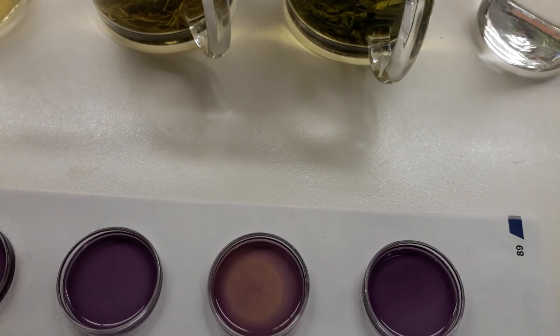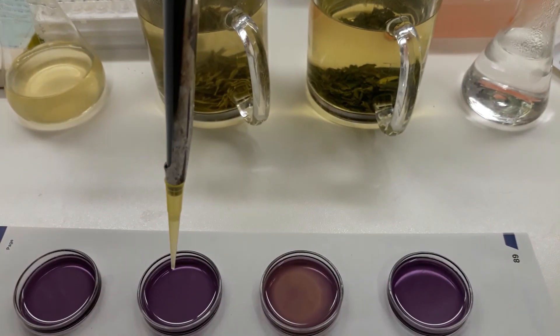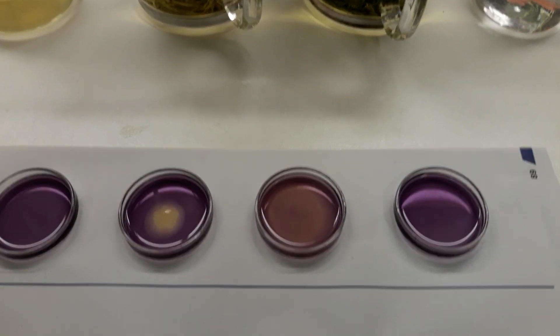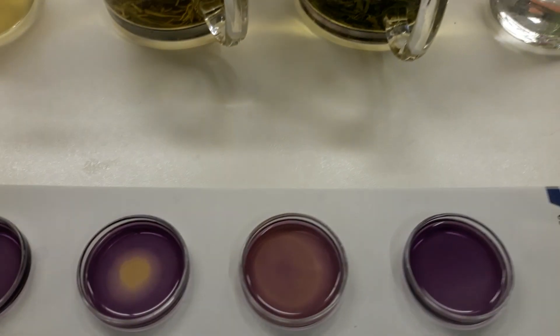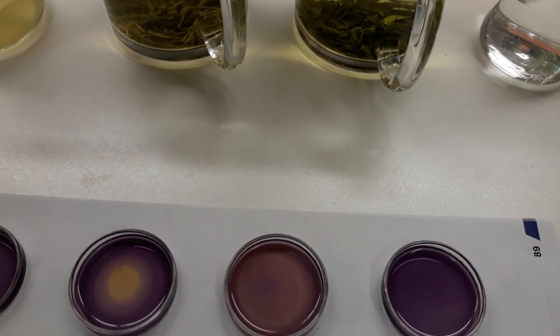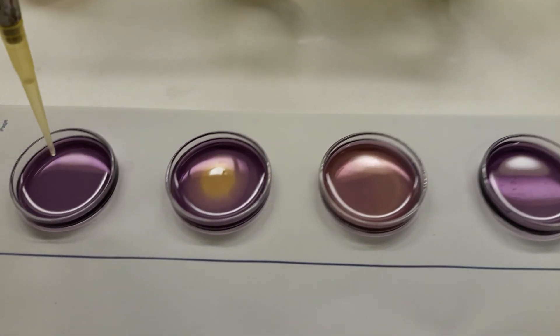Now I go to my Chinese sample — you can see again what is happening here. I change my tips and then I go to my iced tea.